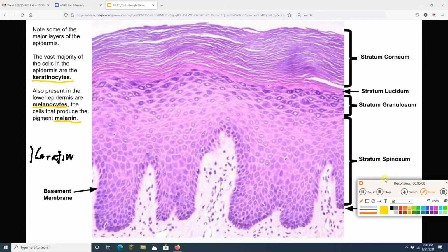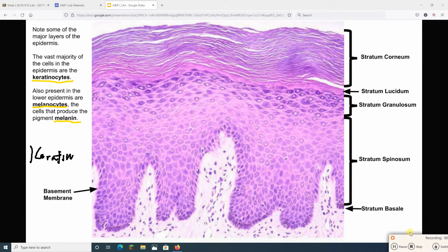All right, I want to point out some of the different layers to this thick skin. Right superficial to the dermis, there is a single cell layer that we call the stratum basale. The word stratum means layer, basale at the base. Check out the weird pronunciation, basale, okay? Then we have a slightly fainter set of cells that collectively is called the stratum spinosum.